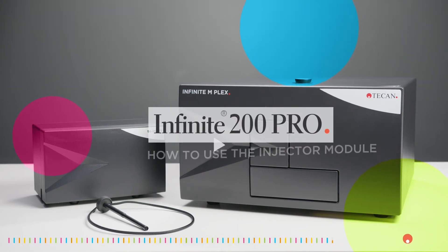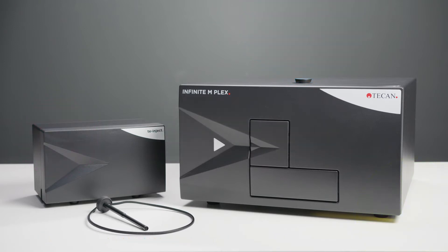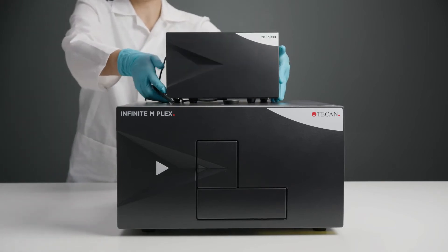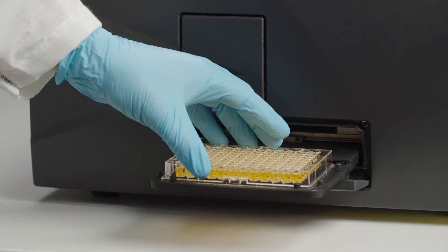Welcome to this video tutorial on how to use the injector module for the Tekken Infinity 200 Pro. Injectors give you valuable dispensing capabilities in up to 384 well plates, ideal for high sensitivity applications such as flash luminescence.